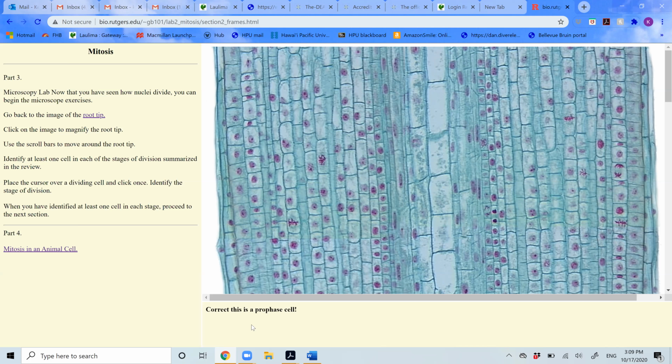Okay, so this is kind of a good way for you to study what these actual cells look like. You might see something similar to this on the exam where you're seeing more of a real cell versus an animated cell, and they are kind of hard to tell the difference, right? So I would practice this. You can see different cells. I don't know where all of them are, but most of them are the more well-defined, bigger cells that your eyes are probably naturally drawn to anyways. So go ahead and click on those, go through this activity.